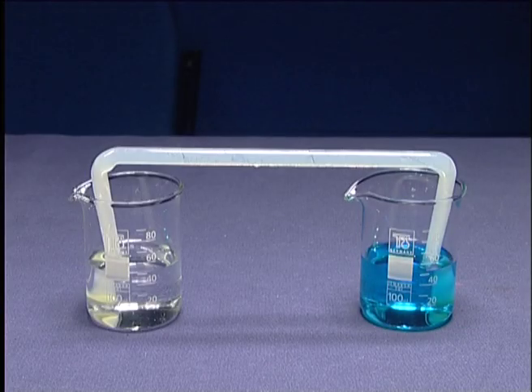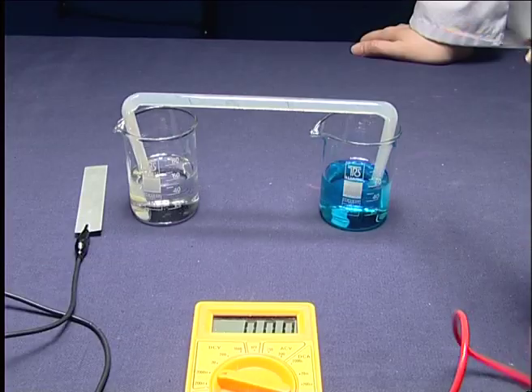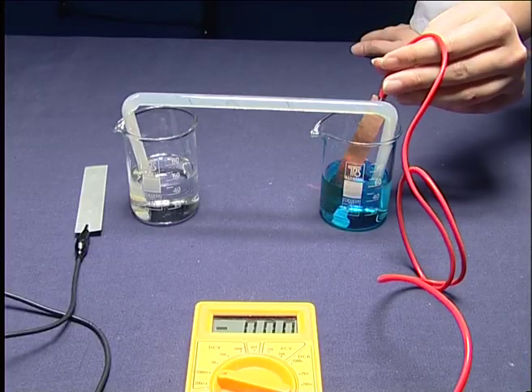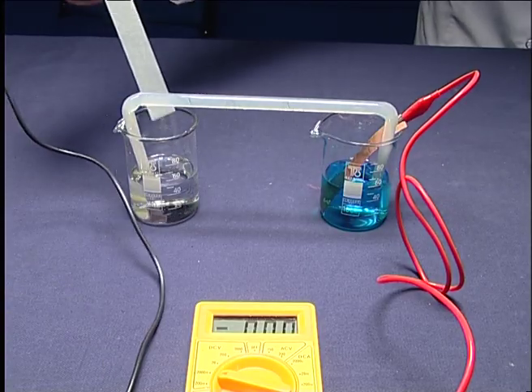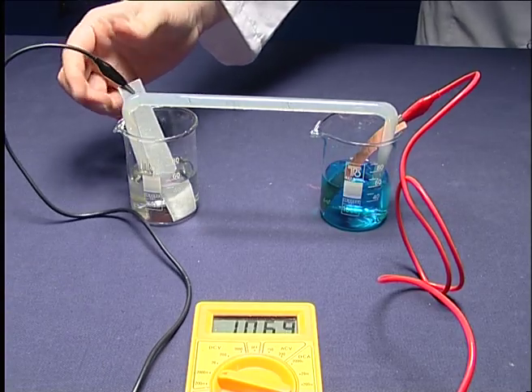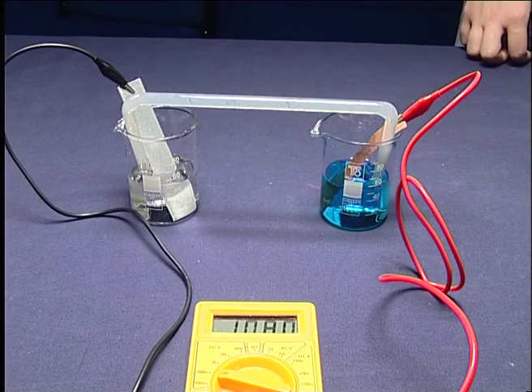Salt bridge including solution of potassium sulfate salt is dipped into the solution. Copper electrode is dipped into the copper sulfate solution while zinc electrode is dipped into the zinc sulfate solution. Voltage is observed by multimeter.